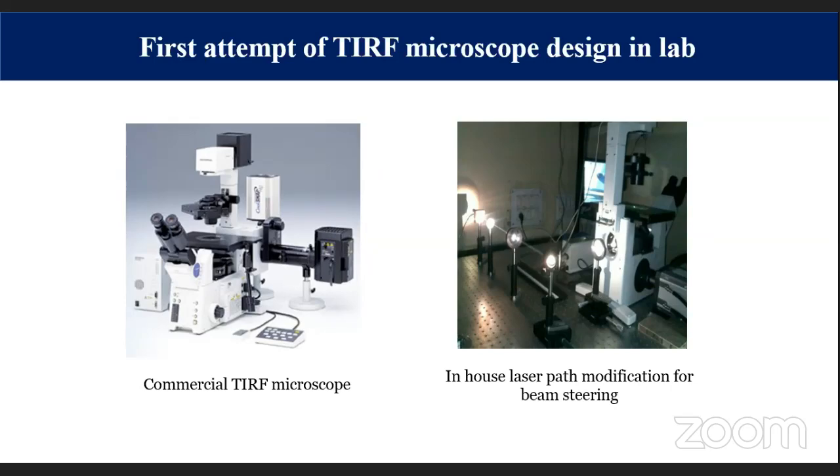I started making a microscope using a few lenses of my own, and the device looked something like that. It was still bulky. I had to manipulate a lot of light, focus, defocus, and put it into a specific point in the objective lens so that I can manipulate it. But it was not a safe setup, because whoever was getting inside the room was in a hazardous situation of getting the flash in their eyes, and it was bulkier to use.